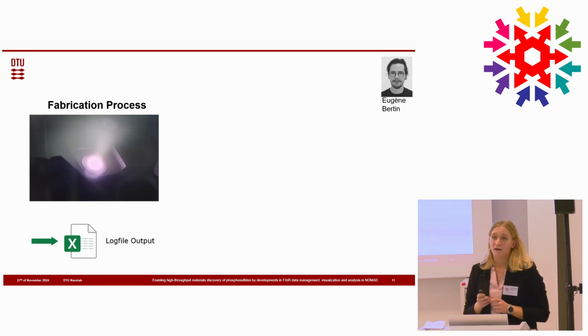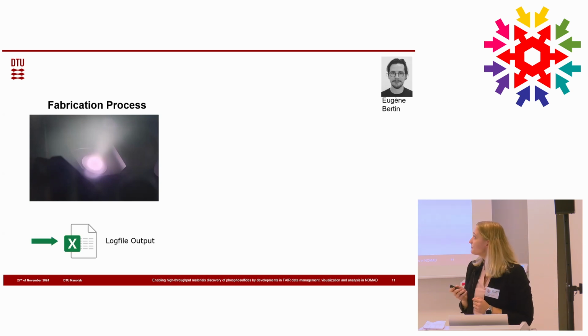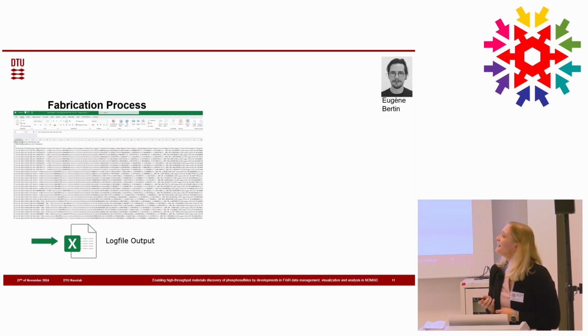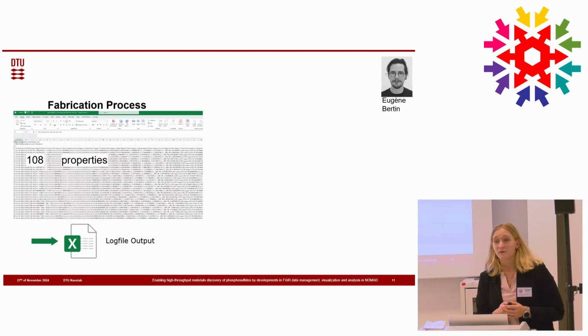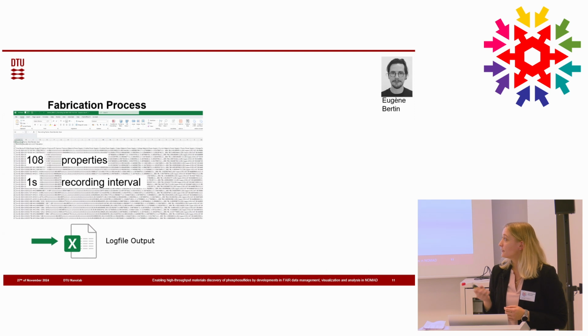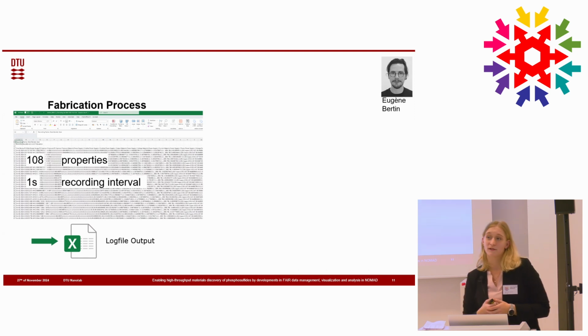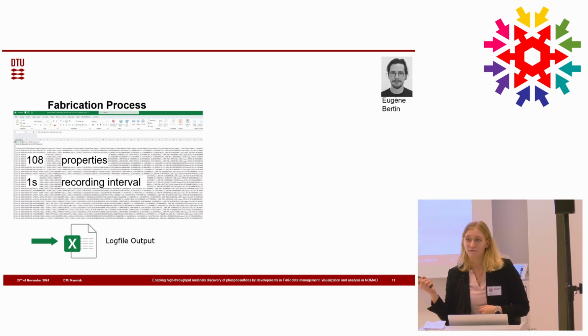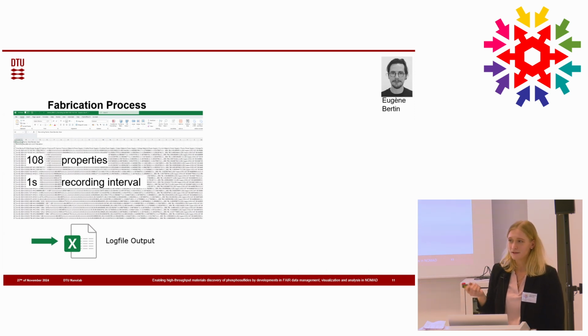And we get a little log file out of our tool, which is very nice, but it looks like this. It's one of the Excel sheets. And we actually keep track of 108 properties, and we record the value every 1 second for about 4 to 6 hours. So if you're a human, this doesn't make any fun. This is not fun to look at. You don't get anything out of it.